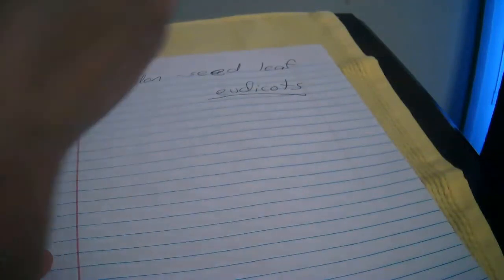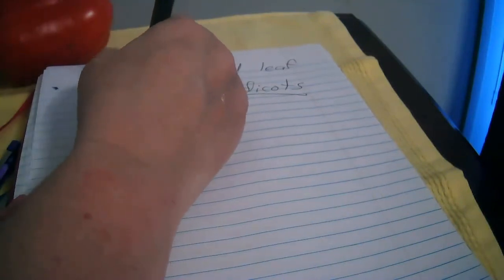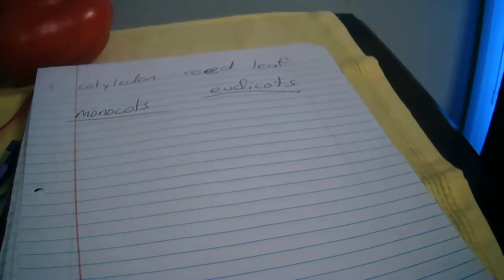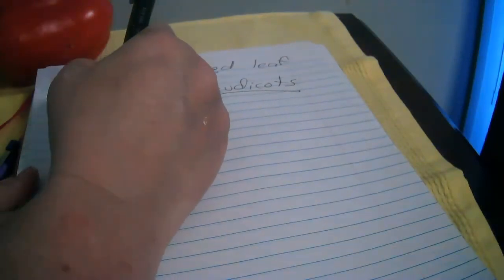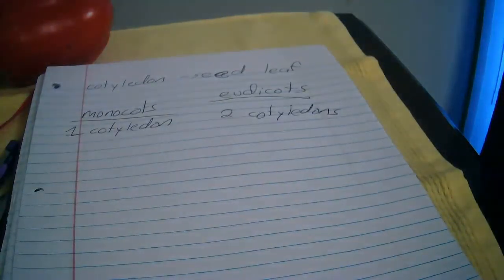Okay, so I'm going to move my black-eyed peas. We're going to make a little table, the monocotyledons and the dicots, the eudicots. You can just call them dicots. One thing that's different is that monocots have one cotyledon, one seed leaf, and eudicots have two cotyledons. And what this means is there are two halves of the seed.